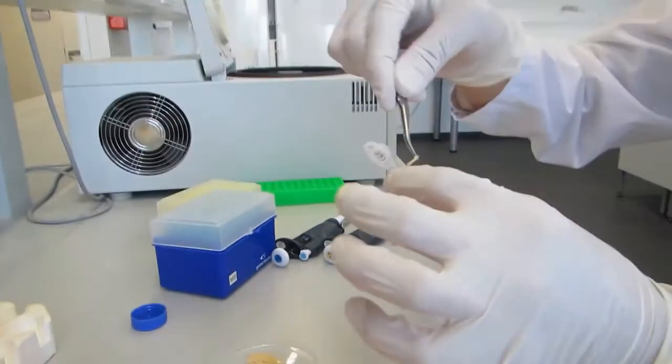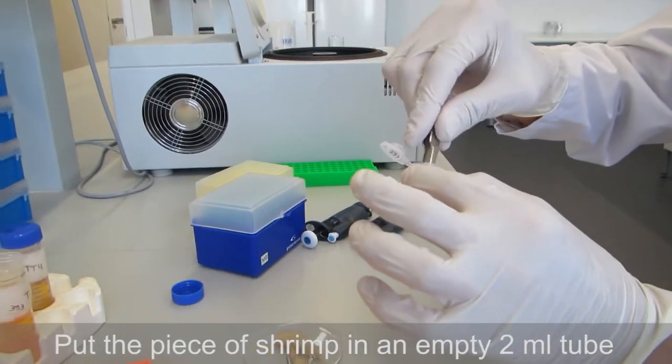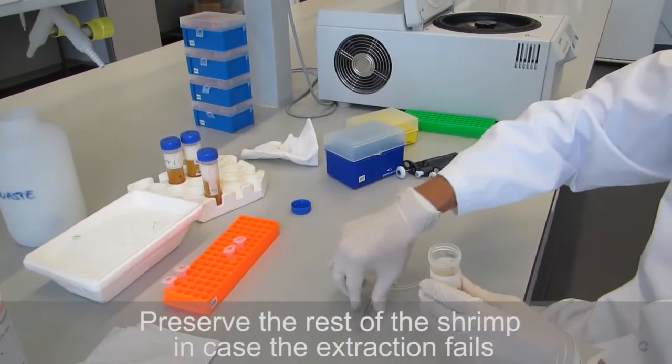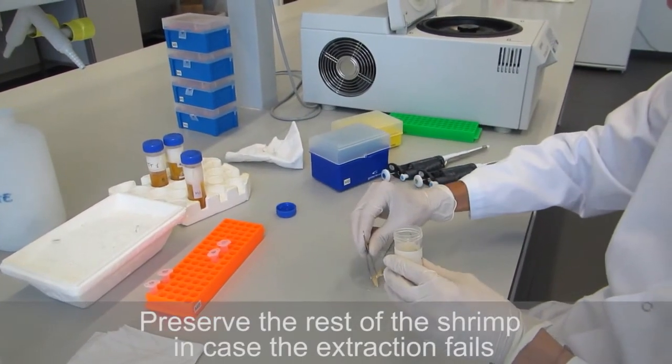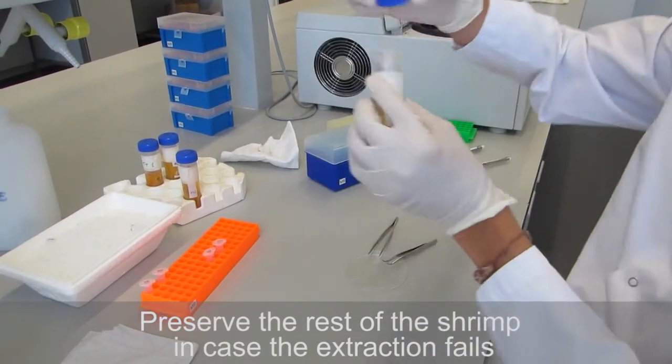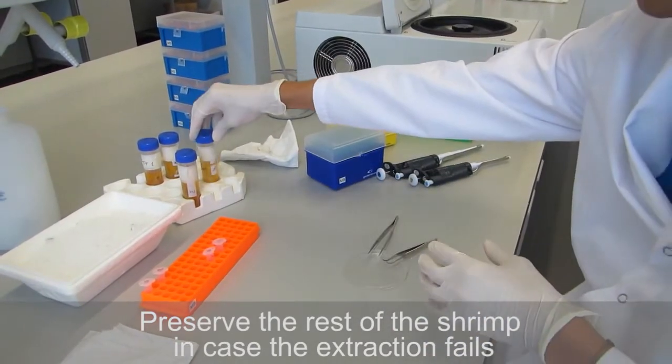So we put it in an empty tube. And the rest of the shrimp we keep in our ethanol for if this extraction fails we still have enough material to do a second one or a third one even.